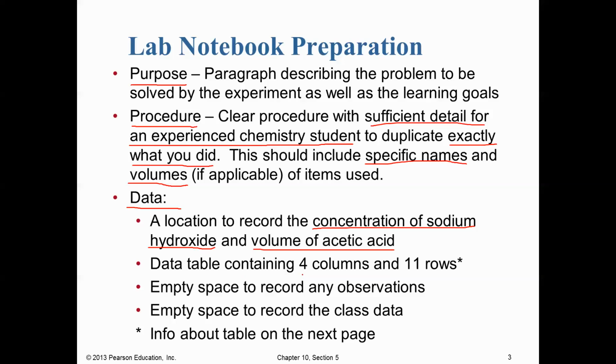It's going to be a pretty big data table. You're going to want 4 columns and 11 rows on this data table. And on the next slide, we'll actually spell out what should be in each of these rows and columns. And that'll hopefully make sense shortly here.